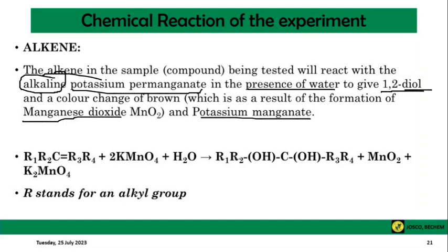We have the alkene on this side, and this is our potassium permanganate. Remember, it is done in the presence of water. These are the products formed.